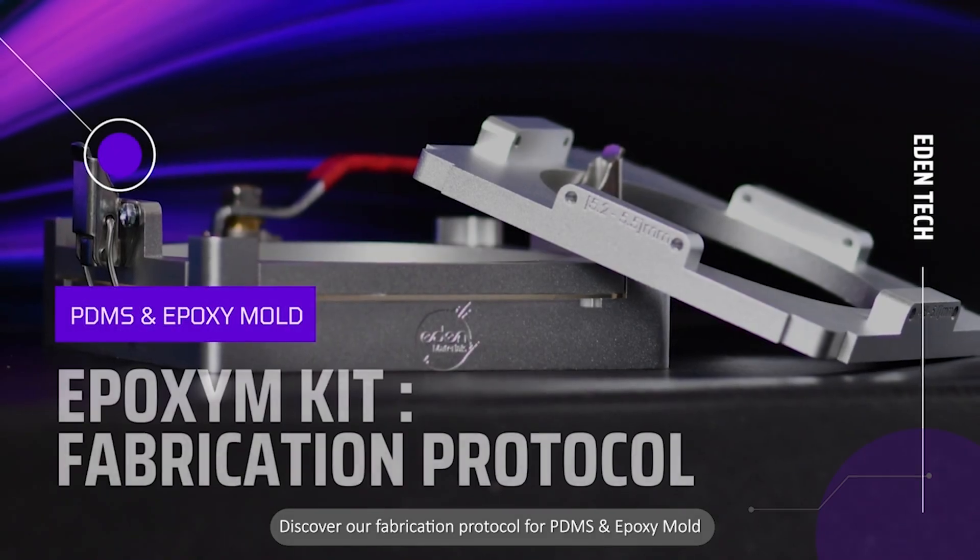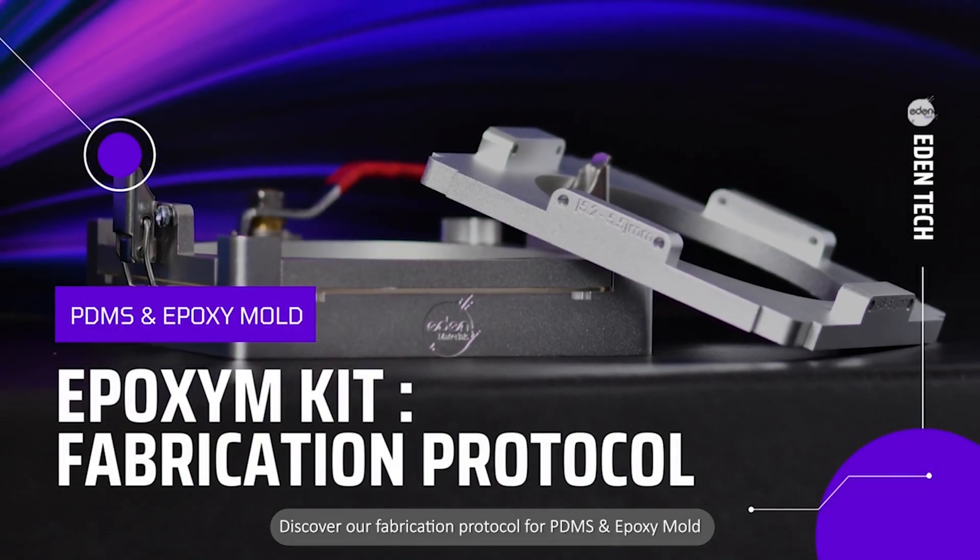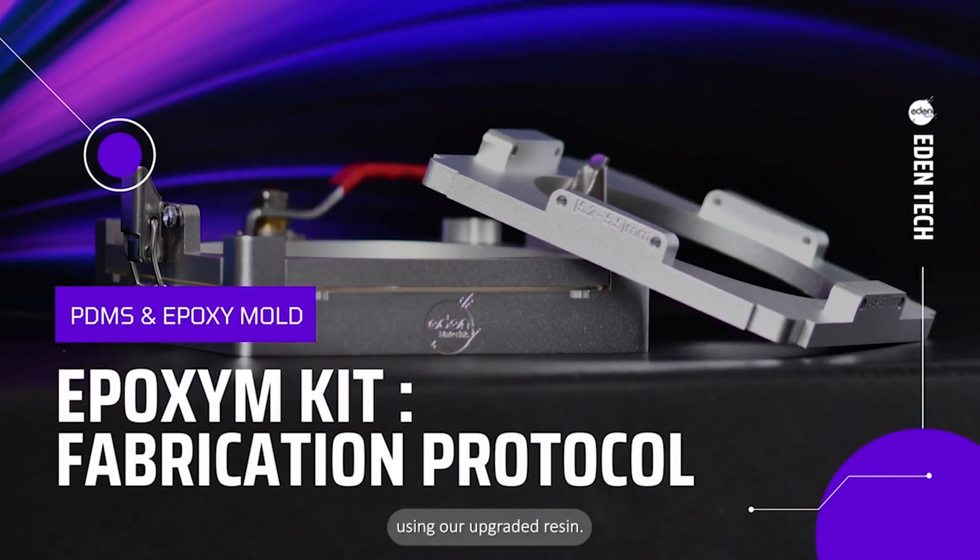Shorter curing cycle? Better resolution? Simple fabrication? Discover our fabrication protocol for PDMS and epoxy mold using our upgraded resin.